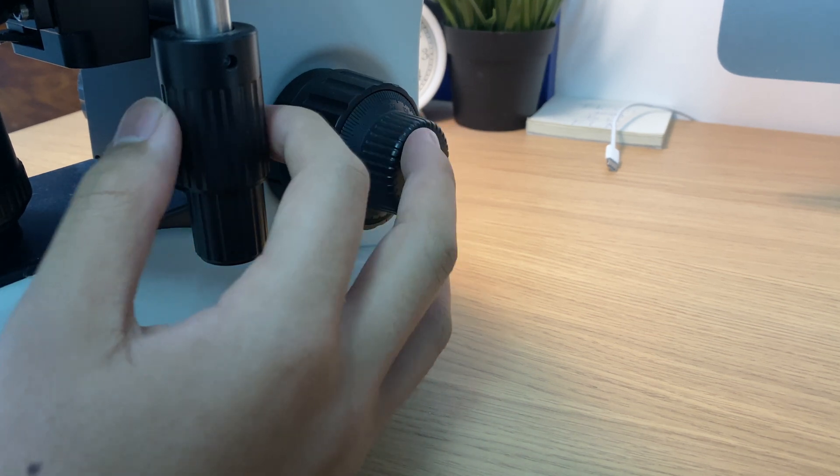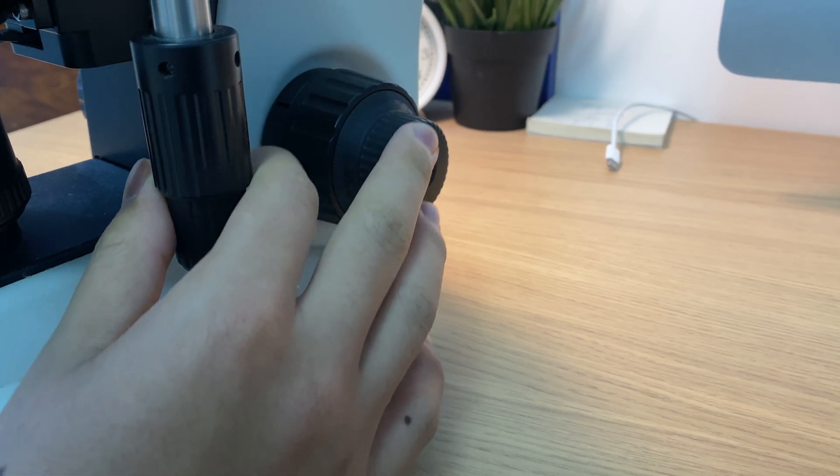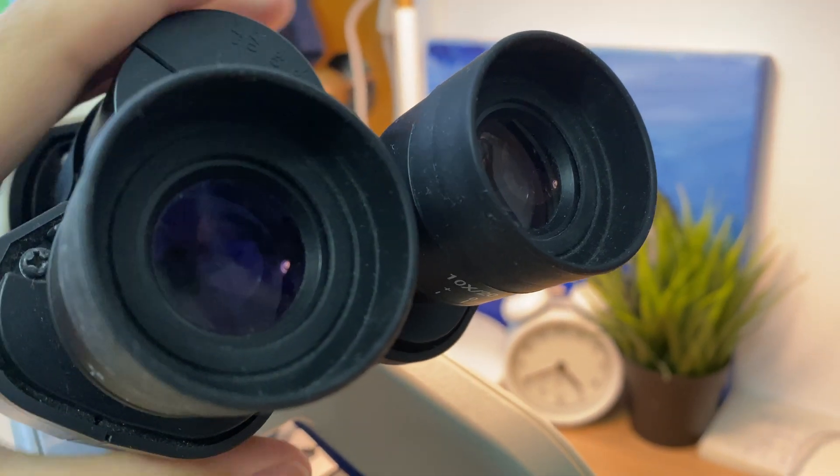Now the things that I like about the microscope. Firstly, ergonomics. This microscope is really comfortable to use because of two things: the binocular head and the XYZ axis knobs. The adjustment knob for the mechanical stage and the fine and coarse focus knobs are placed in such a way that they are very close together and very close to the surface of the table, so I can rest one hand on the table and control all three axes with one hand, which is very convenient. The binocular head and wide-field eyepieces along with rubber eye cups allow me to use the microscope for long periods of time without any eye strain.